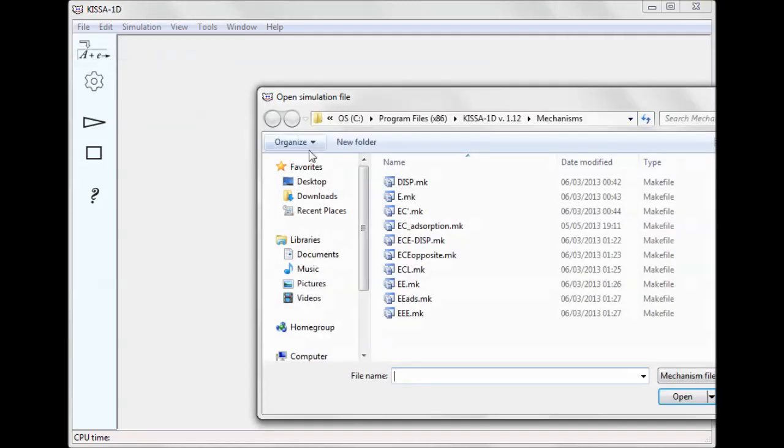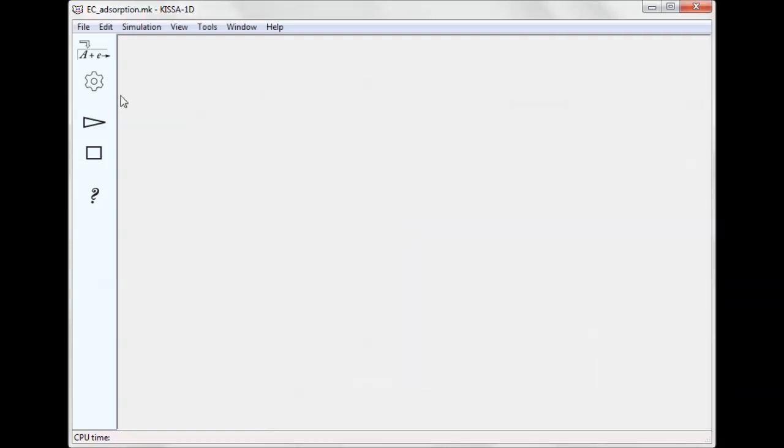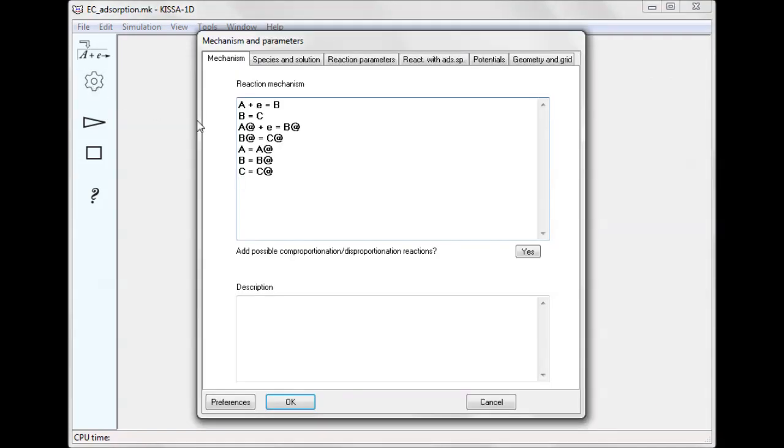To see or modify reactions and their parameters, click the Mechanism Parameters button. The reaction scheme consists of two EC processes involving solution species and their adsorbed counterparts.